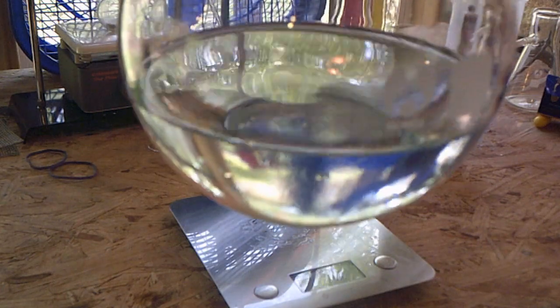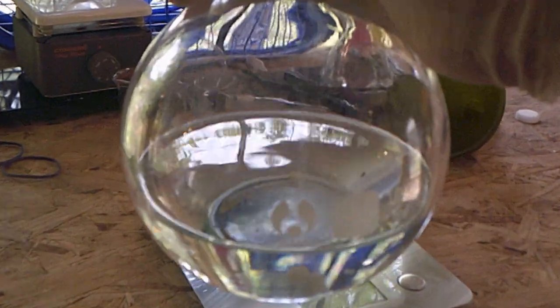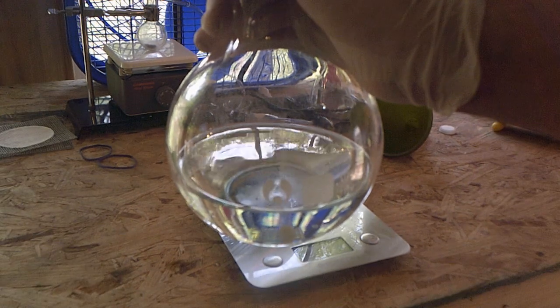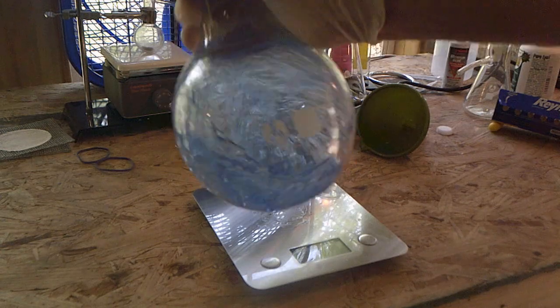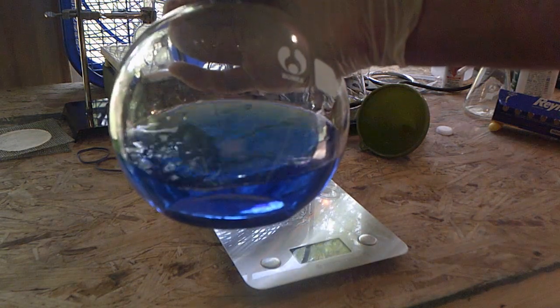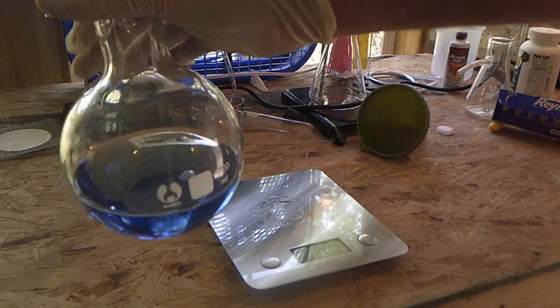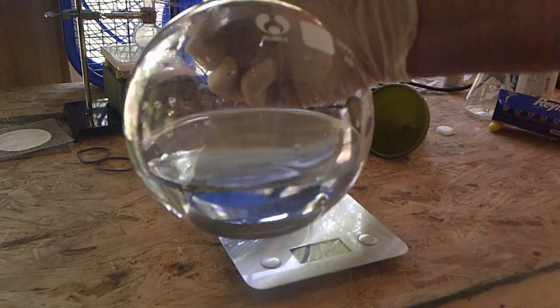So you guys should be able to see right now, pretty clear, not much of a sign of a color change. Some of you guys can see a little bit of blue as I even shook it there, and there is a blue ring around the outside of the vessel. Back there. Now watch when I shake it as we add oxygen back into the solution, and now we're back to a beautiful blue color. And within a couple of seconds, that oxygen is then reabsorbed by the dextrose. We get an acid-base reaction, we get a transfer of hydrogen ions, and the solution goes back to clear.